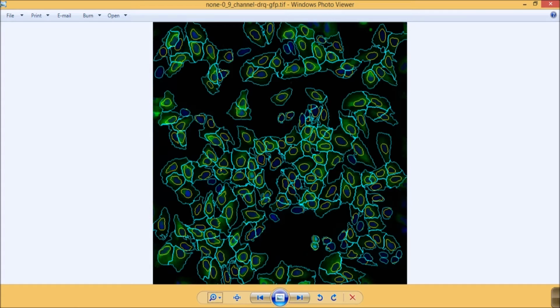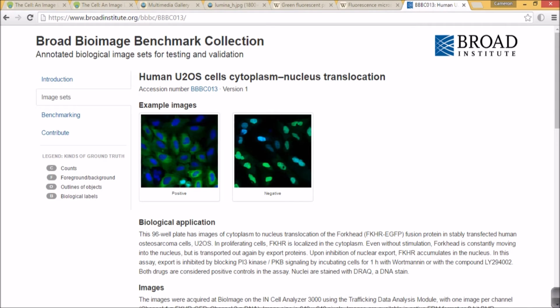With these segmentations, we can computationally measure characteristics such as the count of cells, the area of cells, the shape of cells, and the total intensity of the green fluorophore in the nucleus and cytosol. These measurements are examples of a quantitative analysis of the image. Furthermore, we can perform these processes and analyses automatically on a large number of images to provide statistical power.